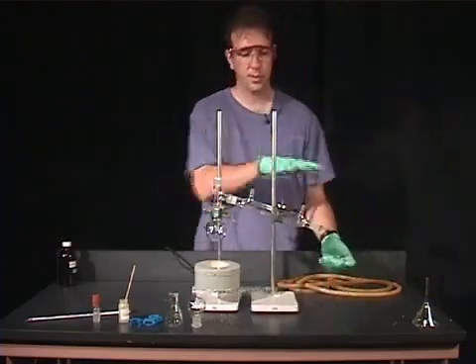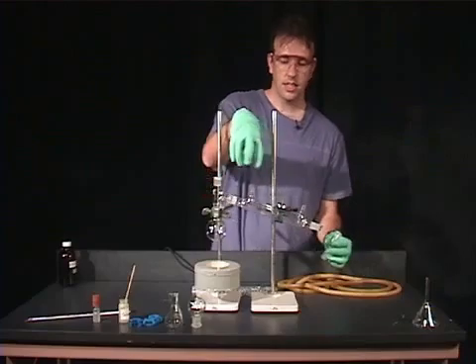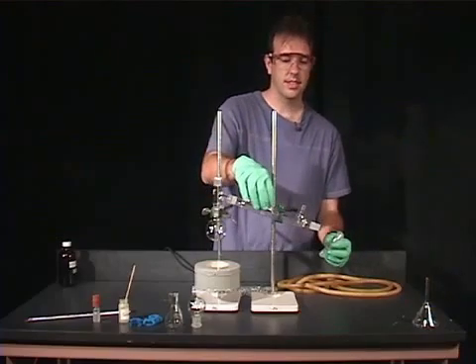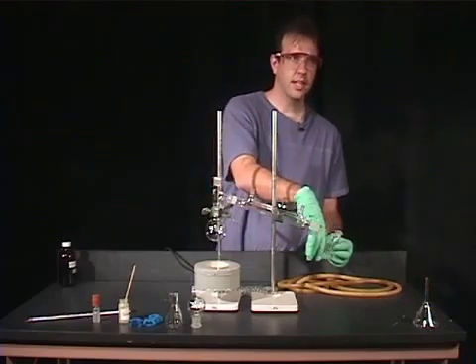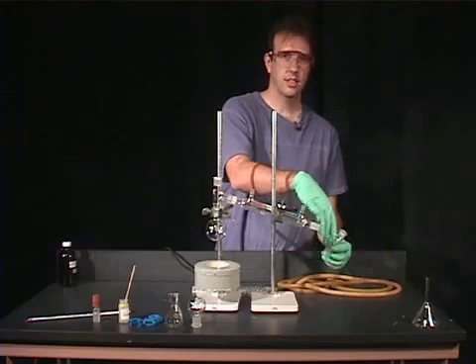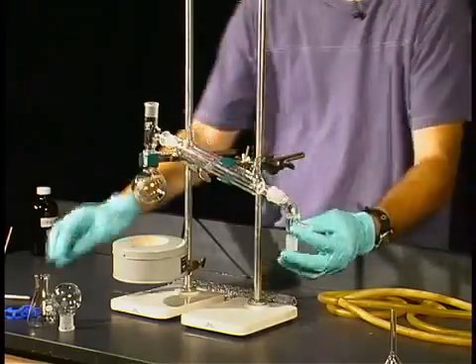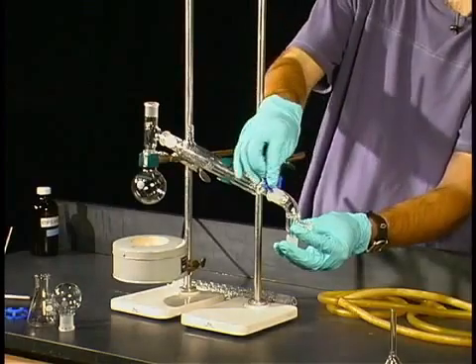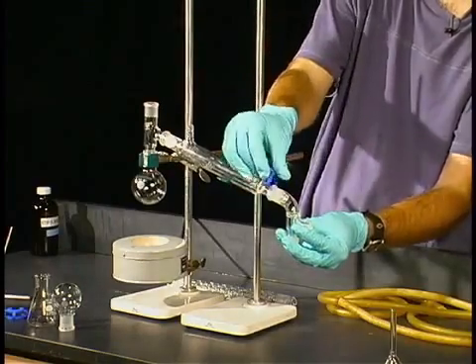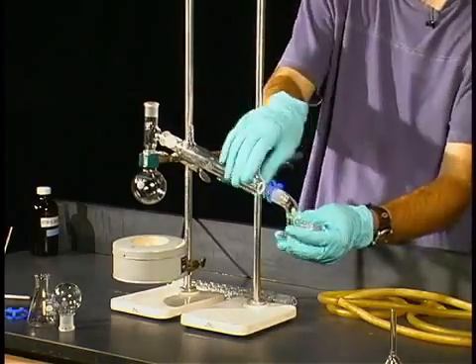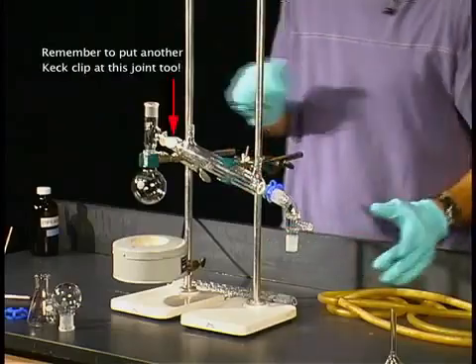At this point, the vapor has gone through the water jacketed condenser and has condensed. So when it reaches the outlet, it is no longer a vapor. So we don't have to worry about grease at this point. We can add our vacuum adapter and add a keck clip here to stabilize our glassware so it doesn't fall off.